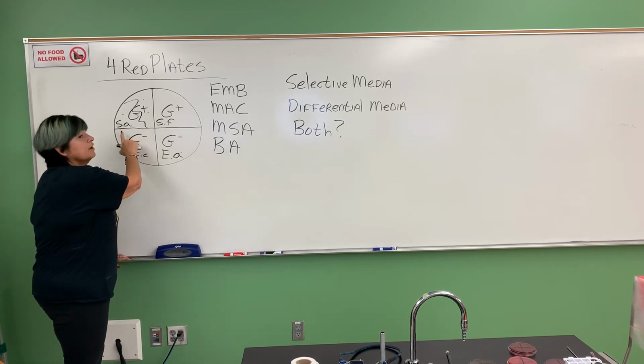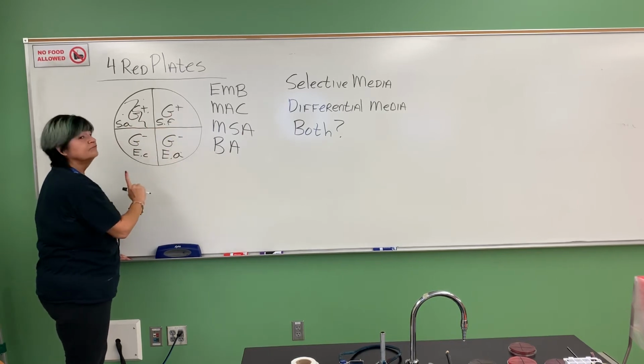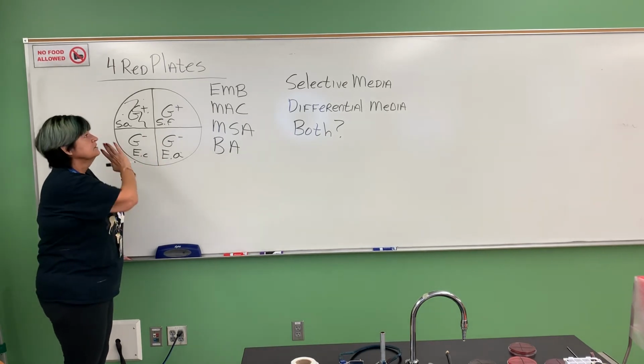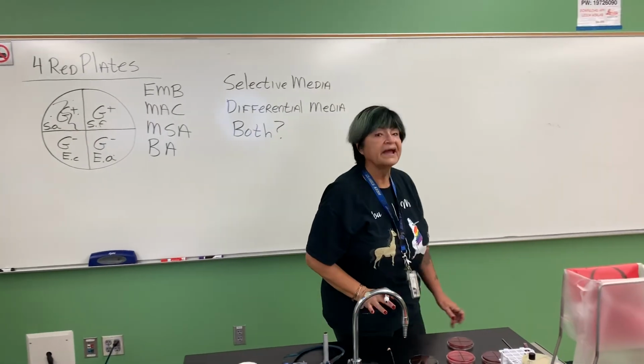We have Staph aureus, S. faecalis, those are both gram positive. For our gram negatives, we have E. coli and E. aerogenes.